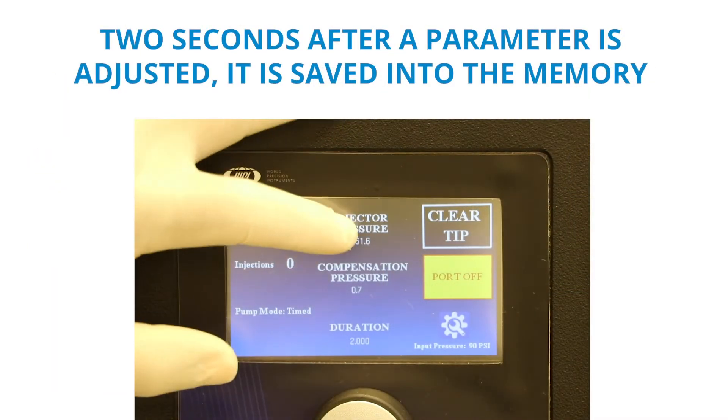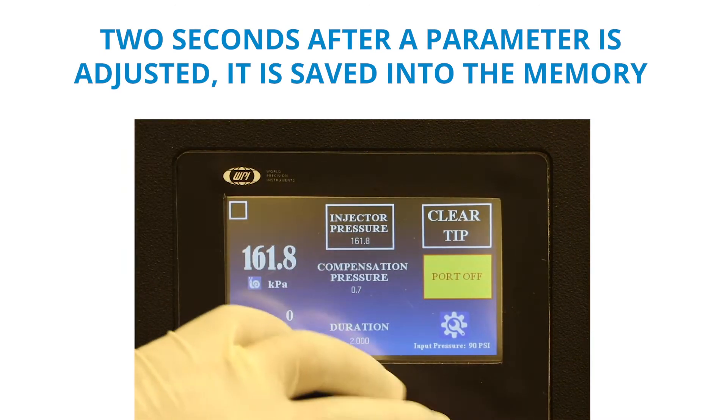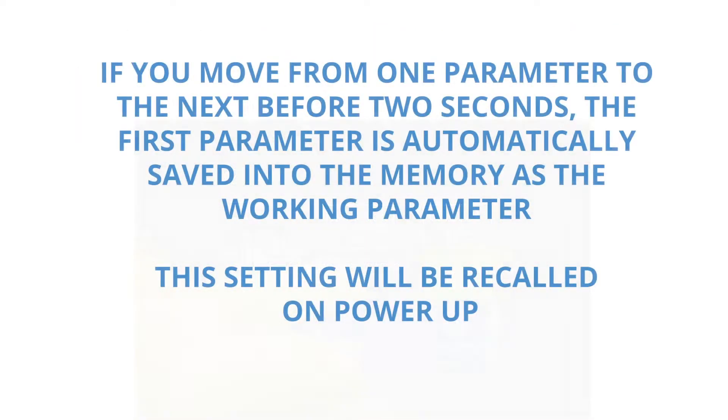Two seconds after a parameter is adjusted, it is saved in the memory. If you move from one parameter to the next before two seconds, the first parameter is automatically saved into the memory as the working parameter. This parameter will be recalled on power-up. This is different from saving and loading protocols in the settings screen.